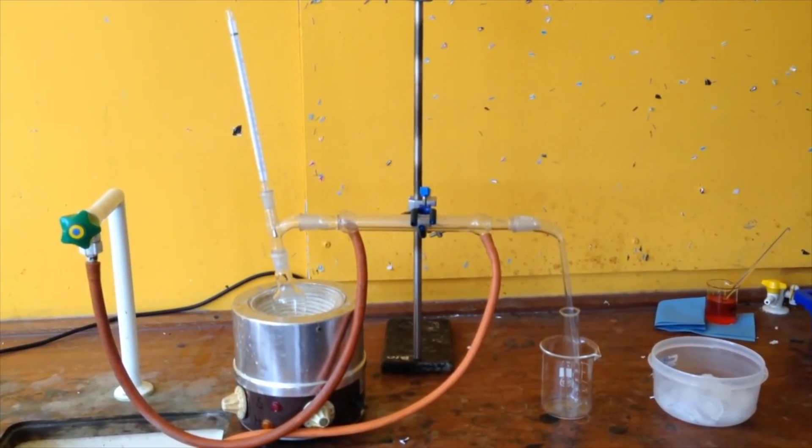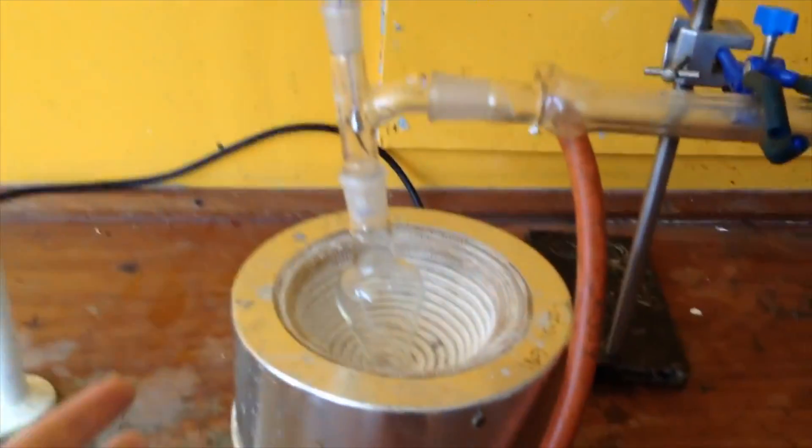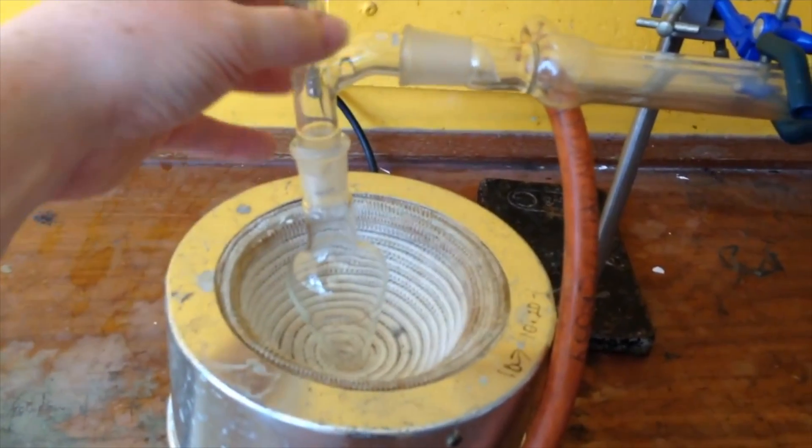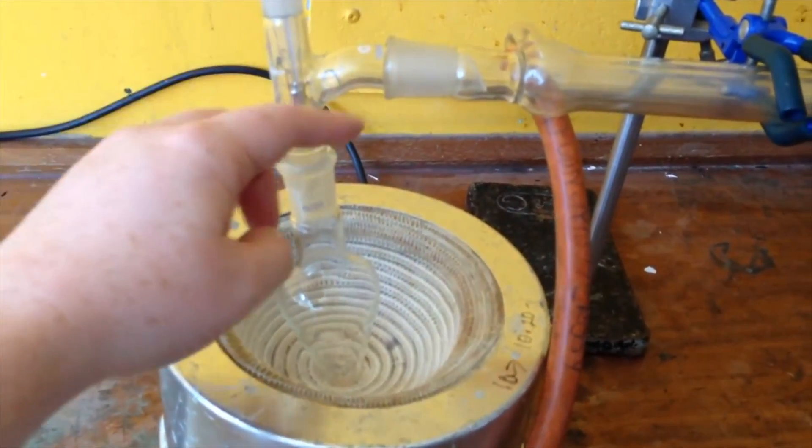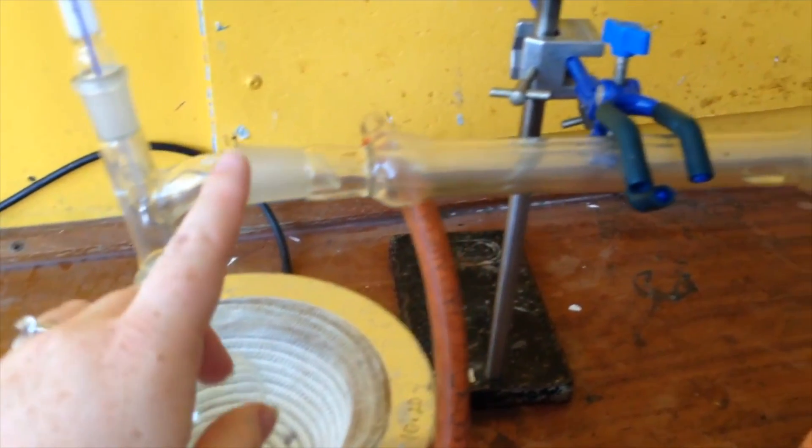So here we have the quick fit glassware set up for the distillation. I have the fancy heating device that I can never remember the name of, the pear-shaped flask going into the adapter here with the thermometer at the top there so I can check the temperature.